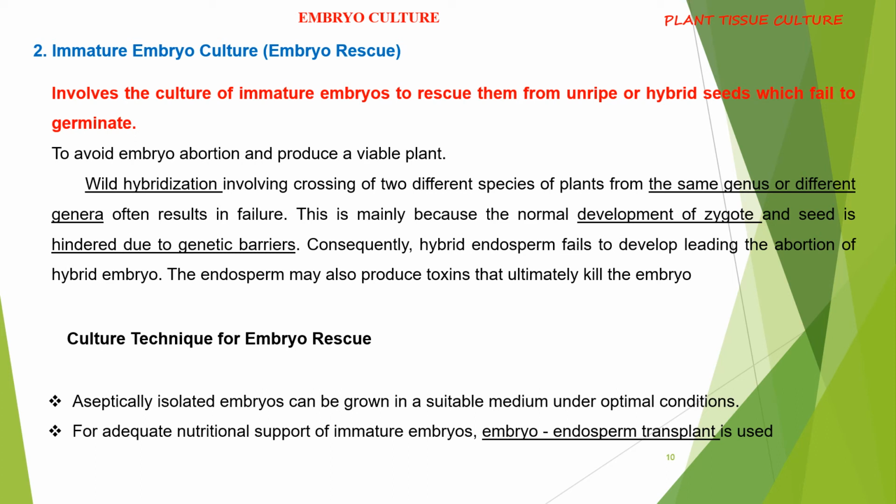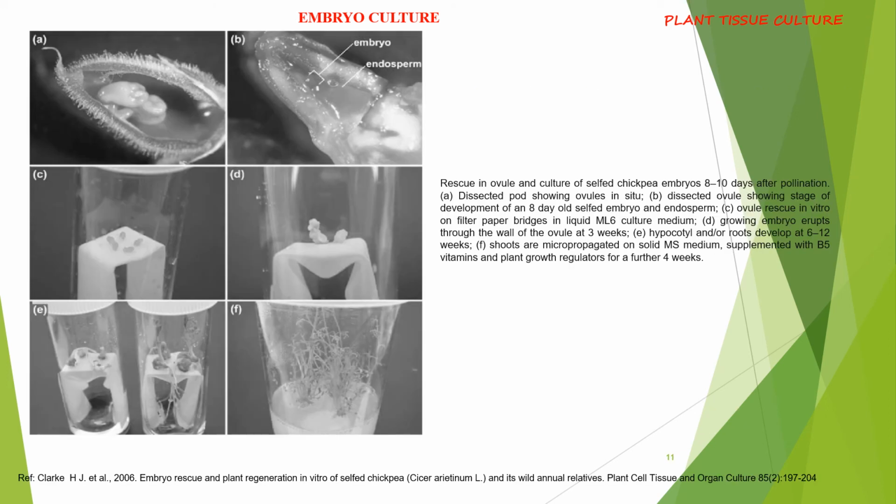In certain cases, nutritional support for the immature embryos is provided by embryo endosperm transplant techniques. The figure here shows the embryo rescue method in chickpea plant. Here, the ovules are dissected and placed onto filter paper bridges in liquid media.